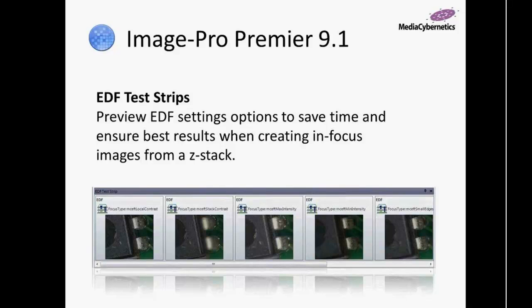create the correct result. And this was actually in Image Pro Plus 7, and we made sure to reproduce this in our latest Image Pro Premier 9.1, and we've even improved it beyond what it was able to do before to make it a lot easier to figure out which is the best option.